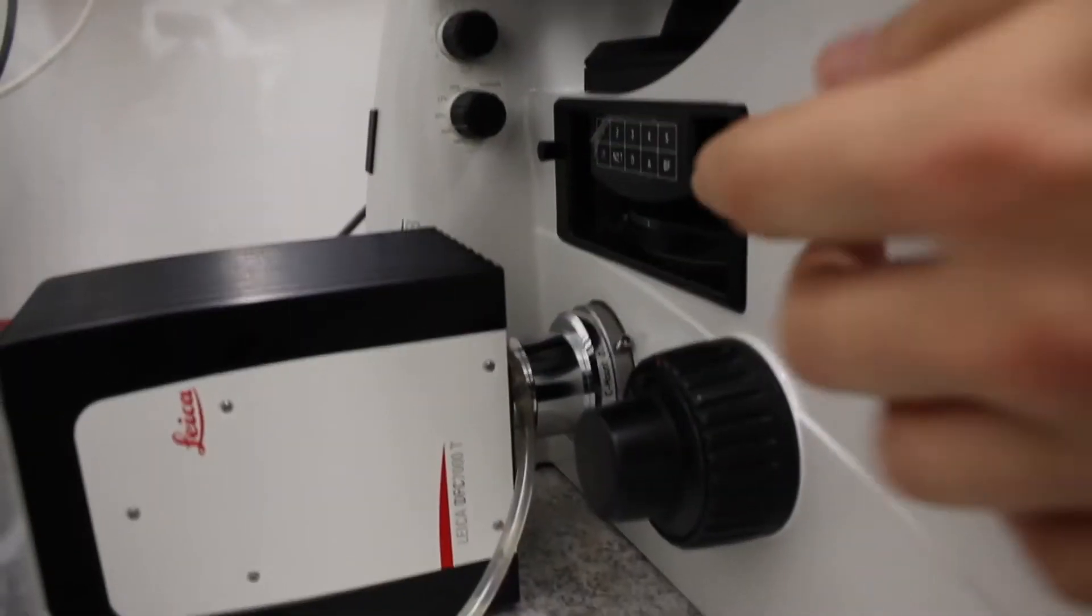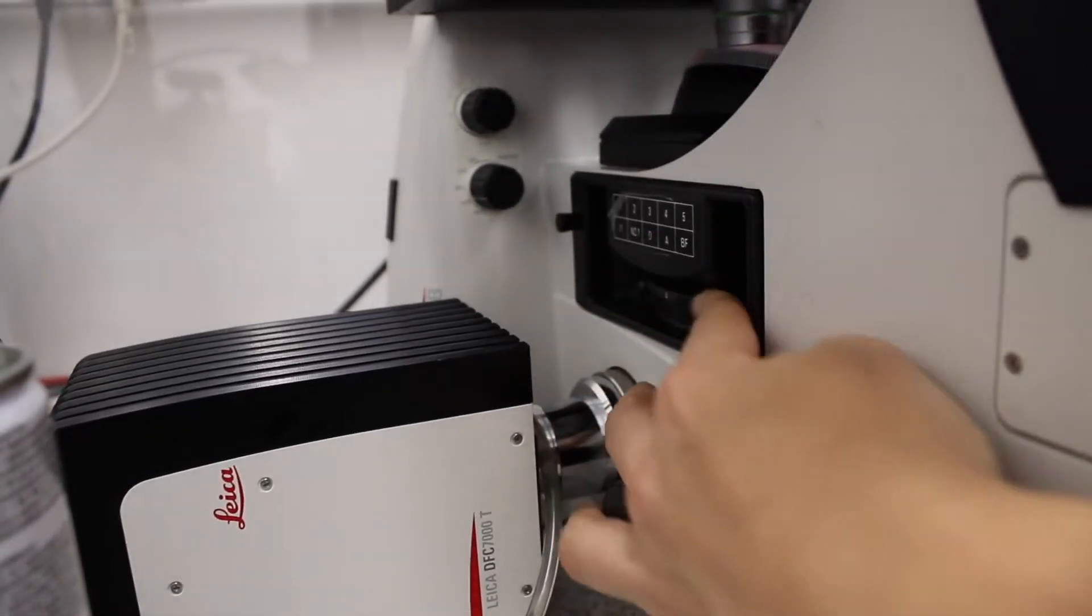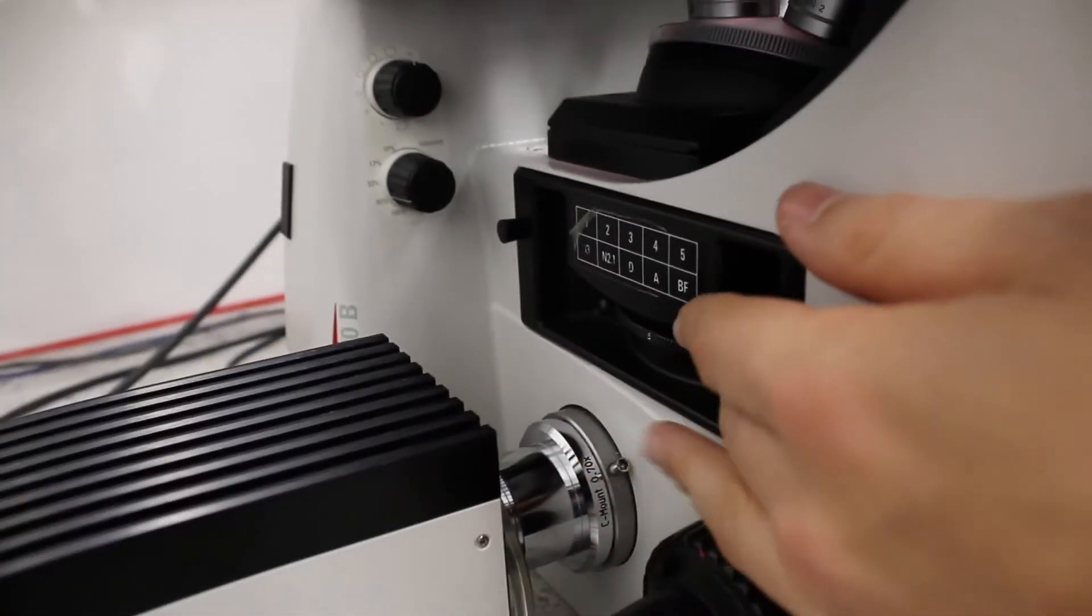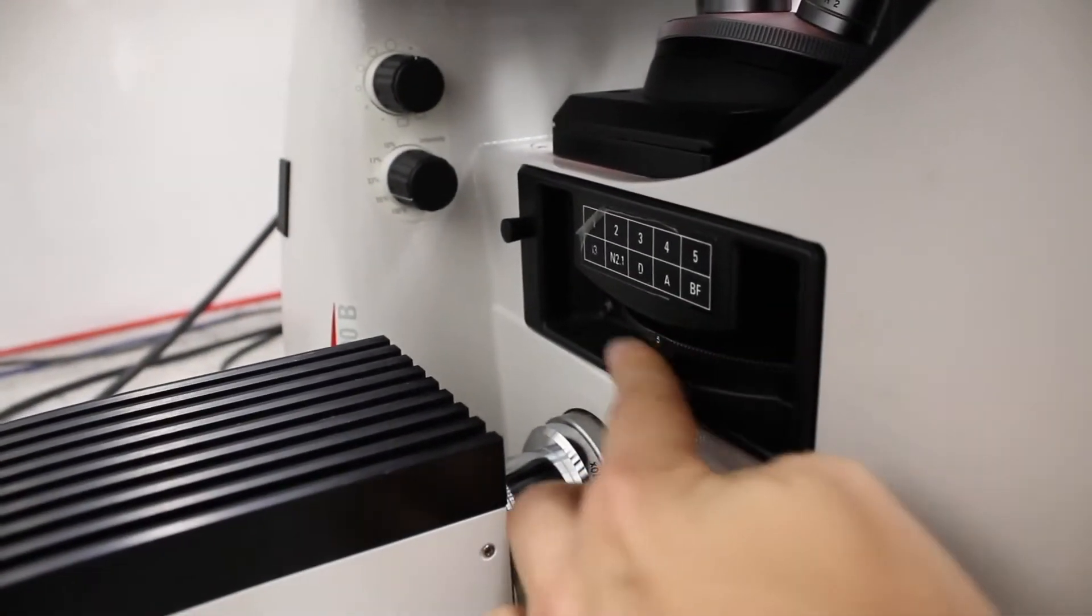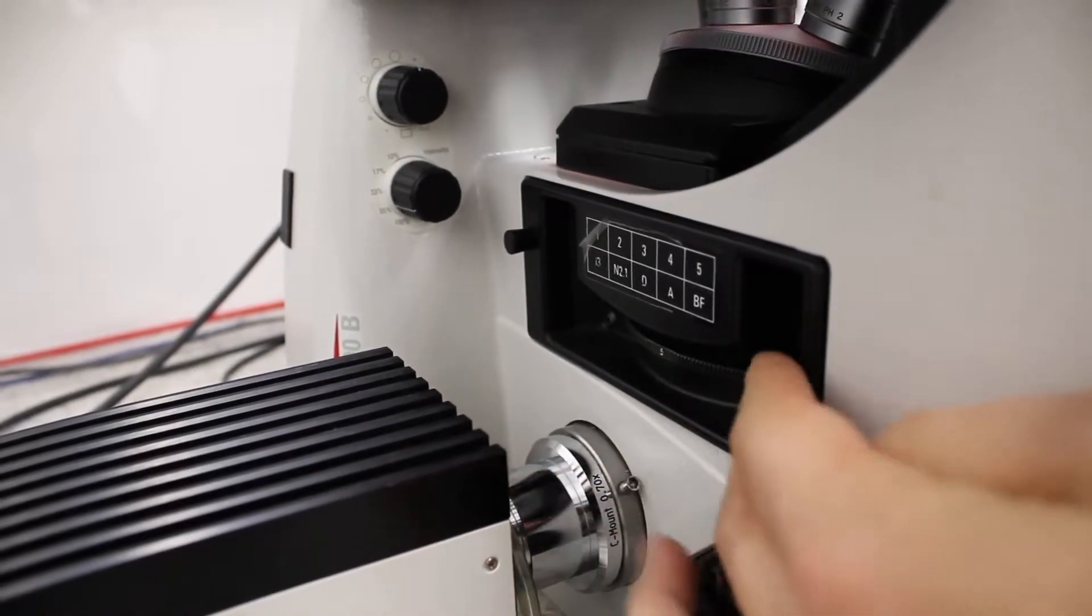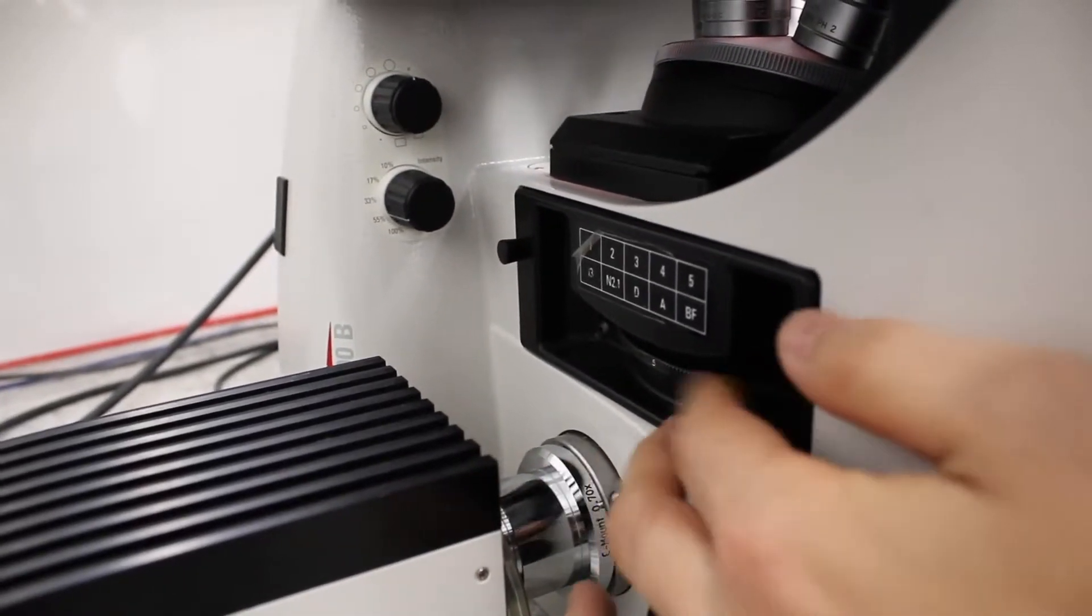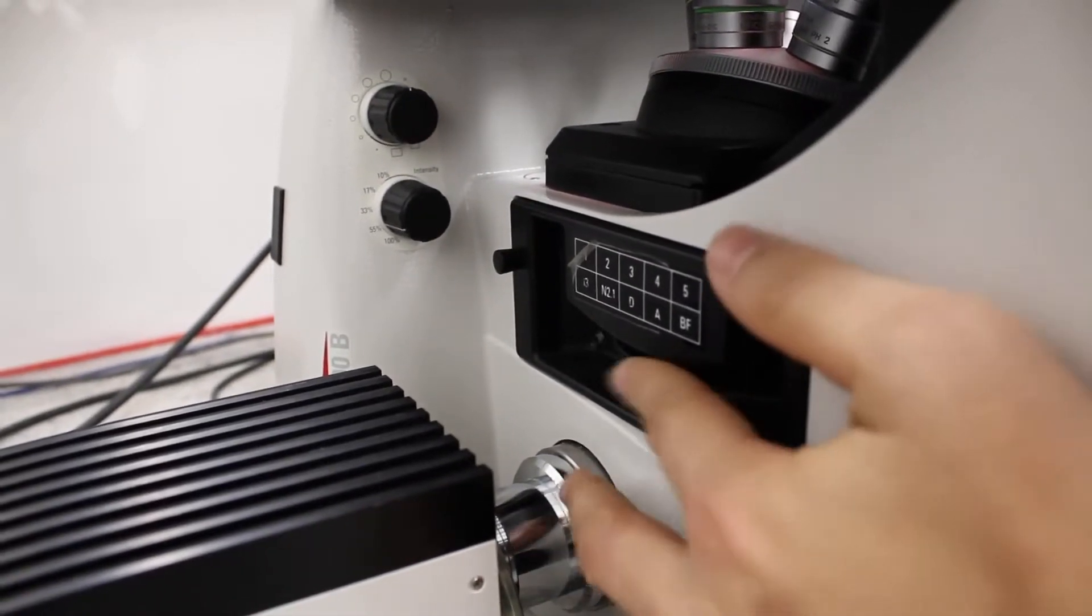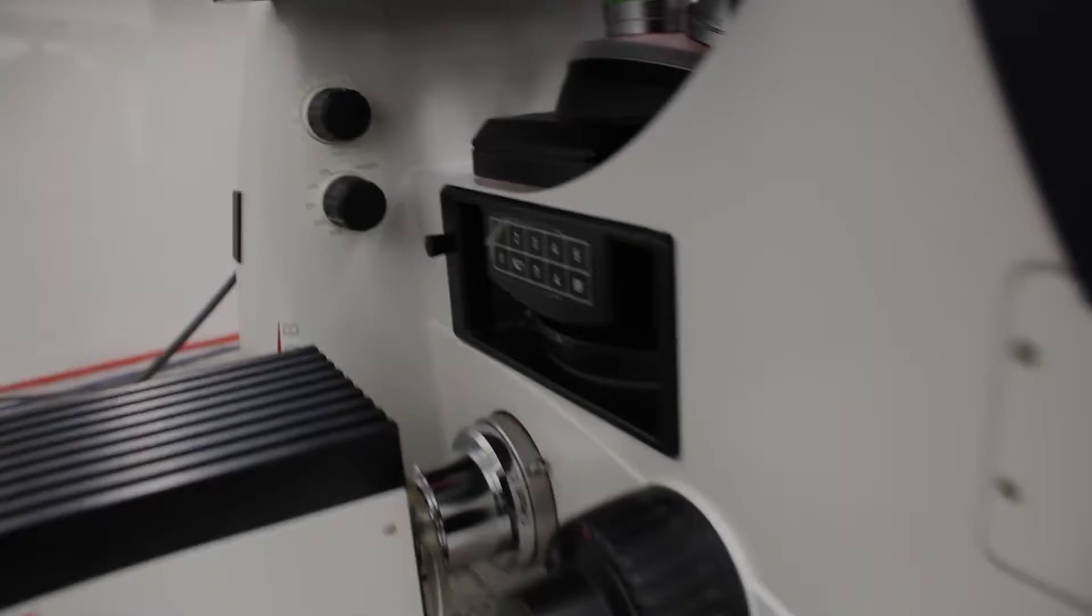So the last thing you should check is that this wheel is called a filter wheel, because there are filter cubes here to select the wavelength for fluorescence. It should be on 5, like here, for brightfield, so there are no filters on. You can move that if you're moving it, you see here it's 1 for example. So let's leave it on 5 for brightfield.